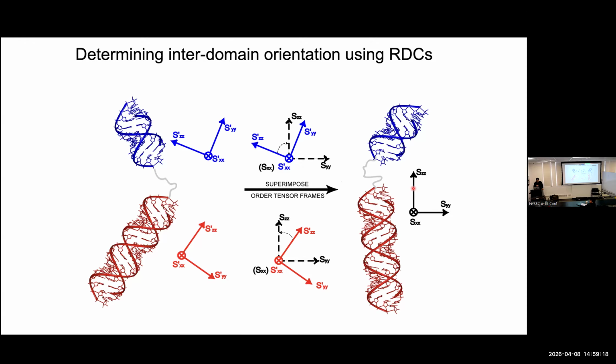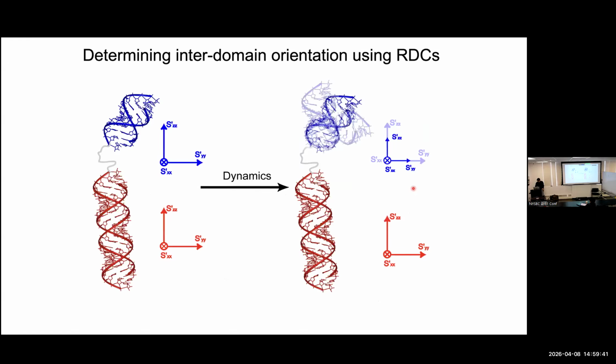Yeah. So if you ask that bond vector, what is your alignment? What would it say? It would say 0. But if you ask the rest of the vectors, what they would say is aligned. So in this particular example, I said very intentionally, the blue one had a smaller alignment tensor, as shown here. So the blue one had the smaller alignment tensor, the blue helix.